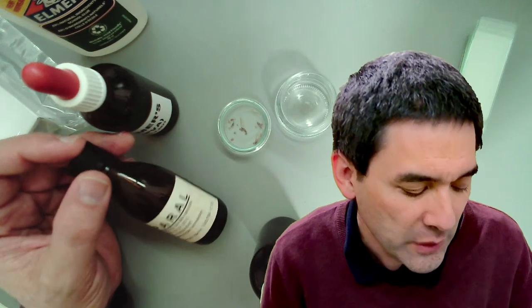However, I got this Euparal some time ago. I think it was through a shop that was selling equipment for people who collect insects, because they also want to use this, or through school supplies companies. So you've got to be patient, but I occasionally have seen it. I think the bigger problem these days is that not all companies want to ship liquids that contain solvents. So that's a new problem. For example, Amazon used to sell stains and mounting media and so on, but they quit doing so because regulations for substances with organic solvents have become stricter right now.